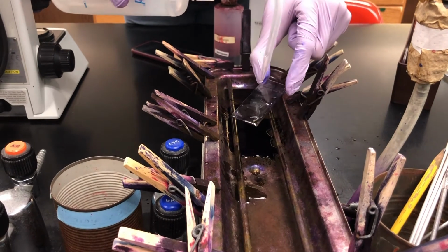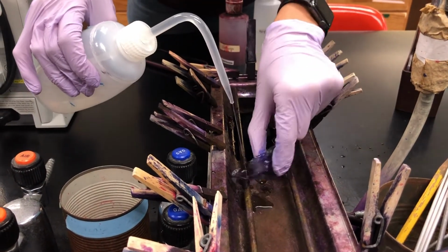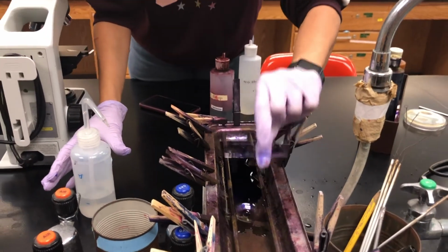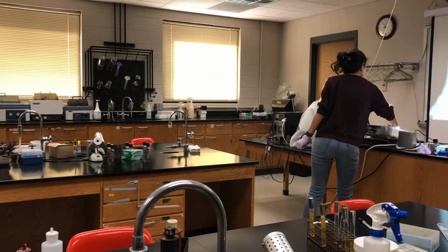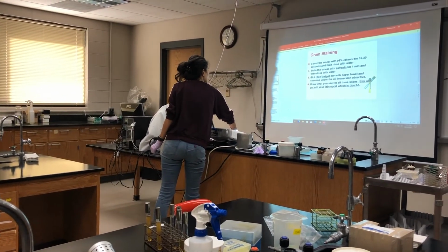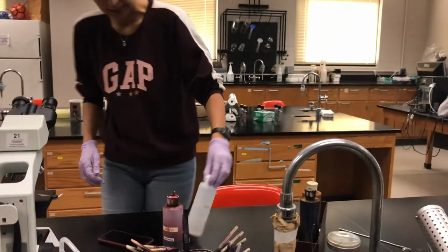Here is water. Okay. After rinsing with water, we need to add the 95% ethanol.